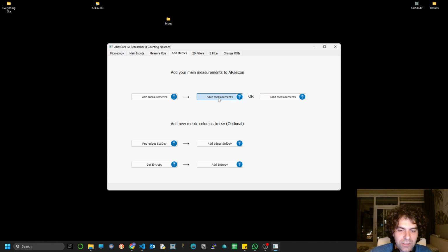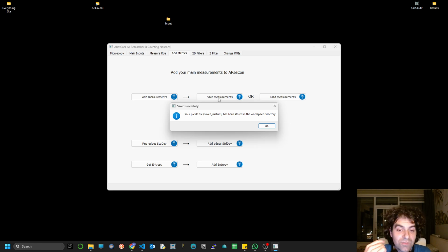And for those of you who are into programming, the reason is that, and I would appreciate some feedback, I made a class in a different module, and I cannot save directly a pickle file by the module. It has to be on the main code. So I'm converting the whole class information back to dictionary, and that takes a bit of time. So any feedback here would be deeply appreciated. So I have saved successfully the pickle file, which is a file of Python, in the sense that it retains information that you can load later on, and it has been stored in the workspace directory.